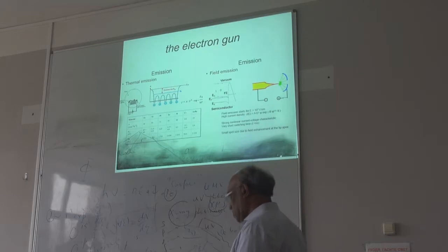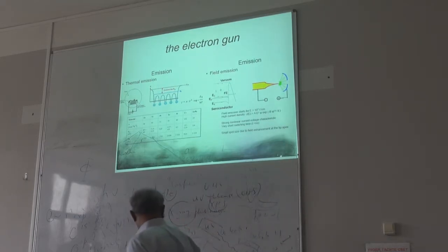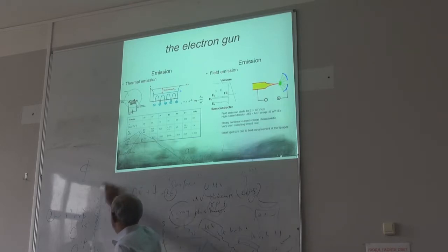The third one is something called the Kelvin probe. That's also another very useful technique. Please remember those. To measure phi, you can use either UPS or thermal emission, or the third one, called the Kelvin probe. Kelvin probe is also very easy.